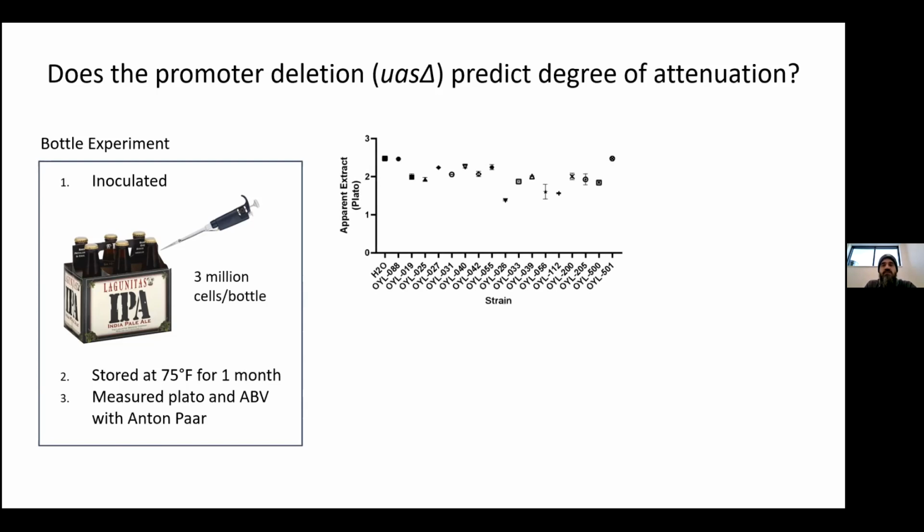And what we found is there's a pretty good range. Except for these first two samples, all of these are STA1 positive yeast, and you see a pretty wide variety in the amount of super attenuation. Consistently, this 026 is always the most diastatic. It's a French Saison strain. It's extremely diastatic all the time.